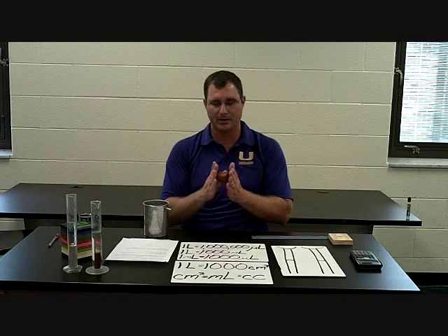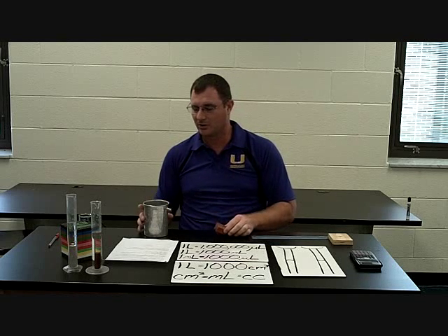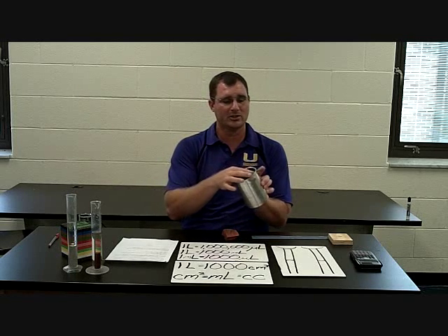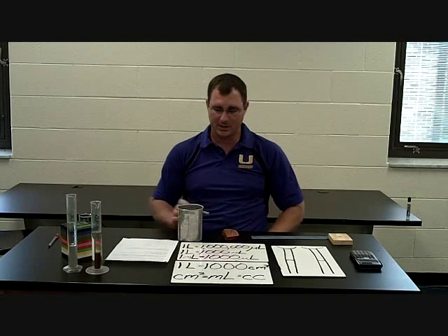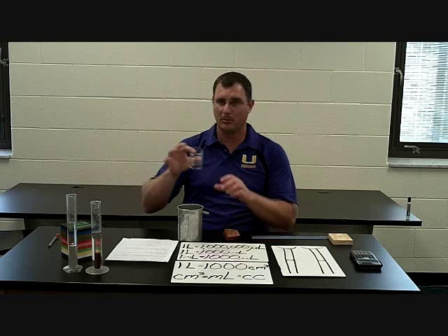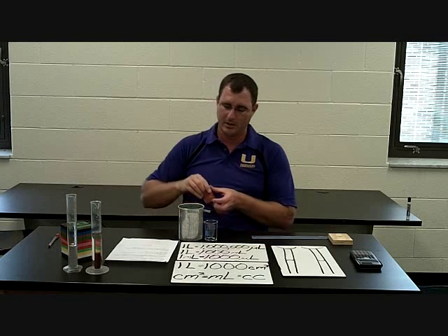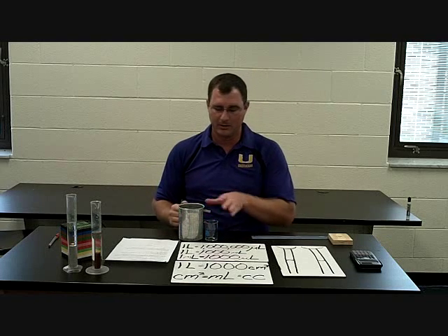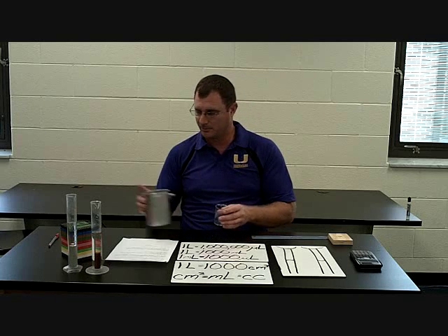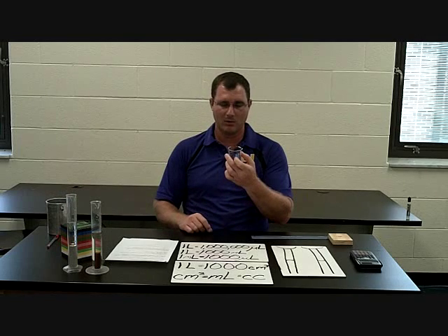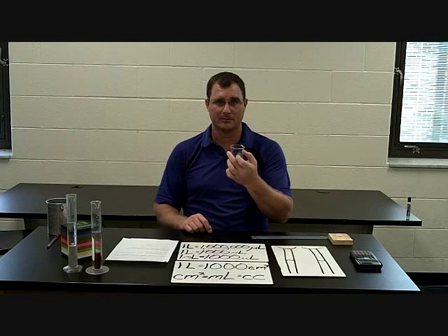And the last thing — I've got this big rock, it's a larger irregularly shaped item. I don't have a sink here, but I'll tell you what I do. I fill my overflow can up with water all the way slightly above the nozzle where it comes out. I set it over the edge of the sink and let it sit until all the excess water drains out. Then I put my beaker directly under it to catch any more water that comes out, and I place the item inside. The excess water comes out, and then I simply measure my beaker — and my beaker ends up being exactly 42.0 milliliters. Hopefully you can use these calculations and complete the next step, which would be the density lab. Thank you very much.